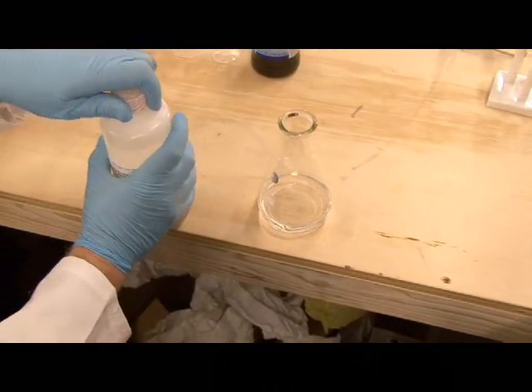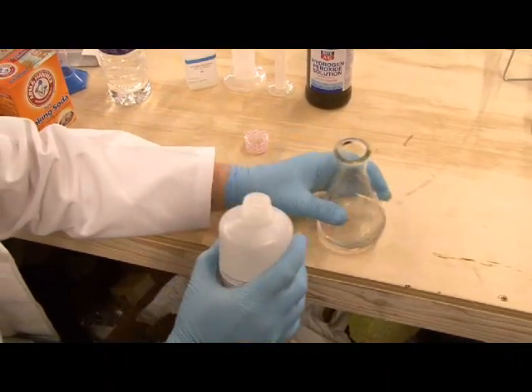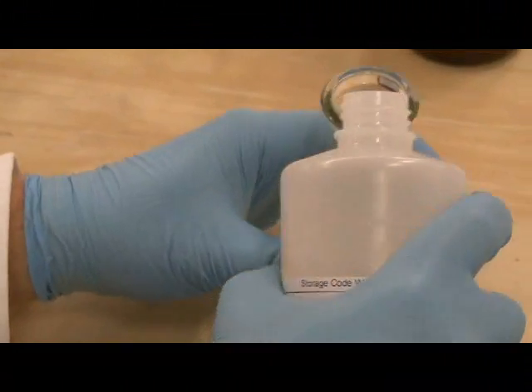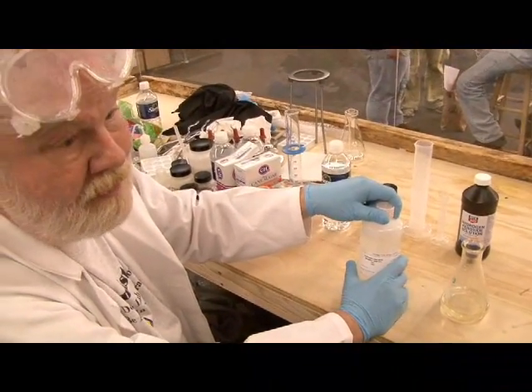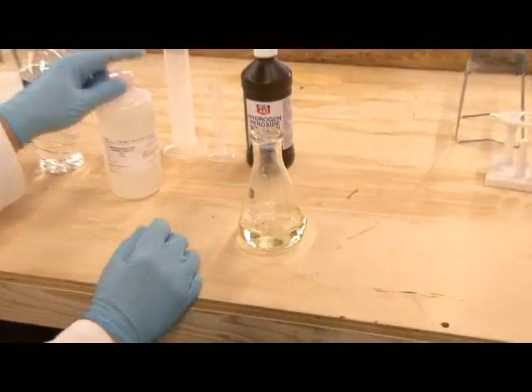The next thing we're going to do is add some hydrochloric acid. This is concentrated hydrochloric acid, reagent grade from a chemical supplier. But you don't really need that — you can go down to your local Home Depot and buy a one-gallon bottle of muriatic acid, which is almost as concentrated, and that's just an old name for hydrochloric acid. We swirl those together to mix them.